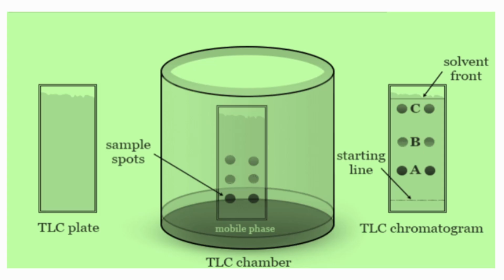According to the experimental technique, firstly we have to select a stationary phase. After selection of the stationary phase, we have to select a TLC plate or glass plate. In the third step, we have to coat this stationary phase on the TLC plate.